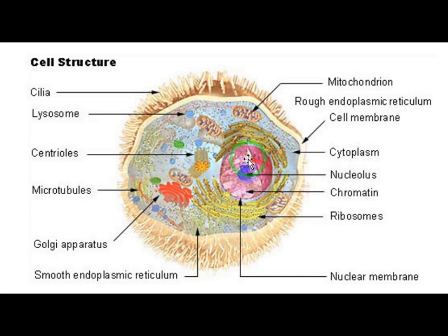which can selectively bind to the nucleus with orange fluorescence molecules, and some others, for example, to the Golgi with blue fluorescence molecules, and we treat the cell with all of these antibodies. And we look at the cell structure under the microscope, we can differentiate between the different parts of the cells based on the colors that we get.